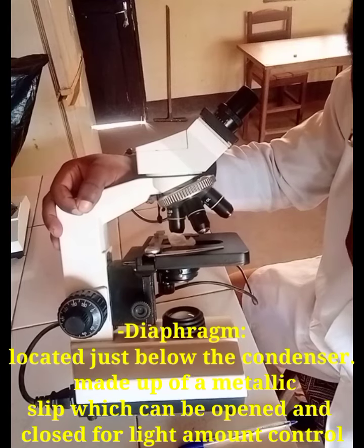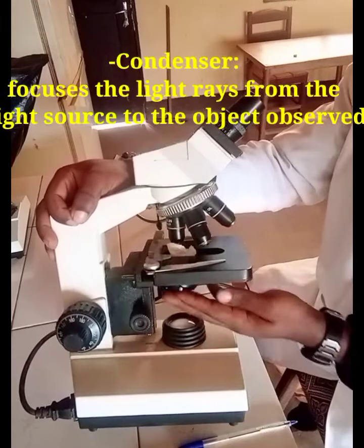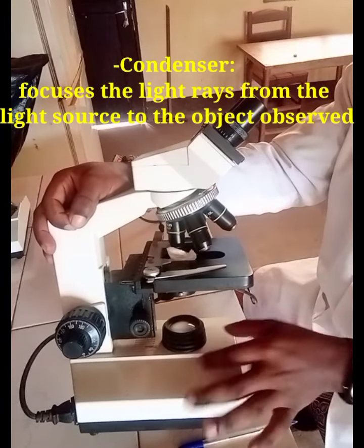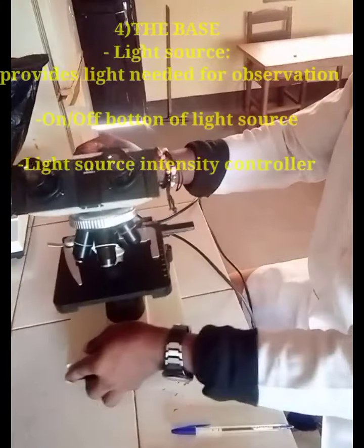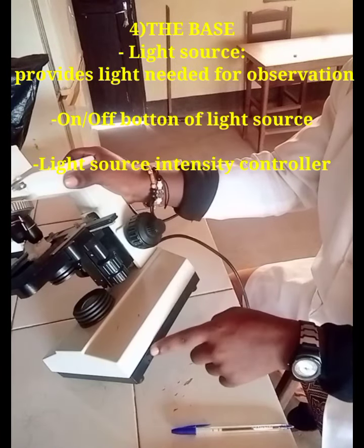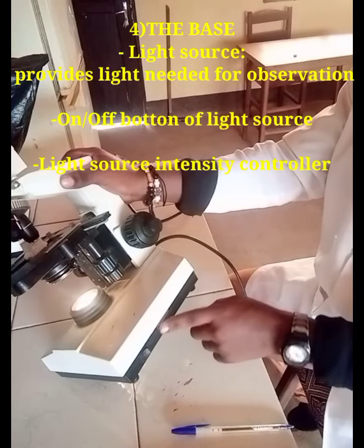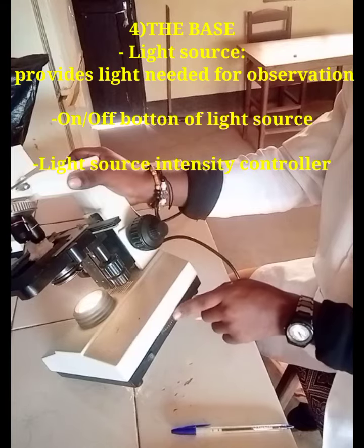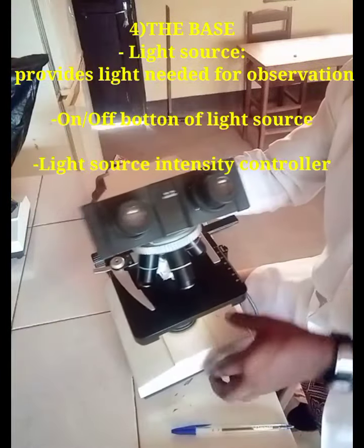Below the stage we have what we call the diaphragm and the condenser, to help us condense the light from the light source. Here is the light source. And here is the on and off button of the light source. As you can see, here is where we turn on the light source. And here is where we control the light intensity of the light source.